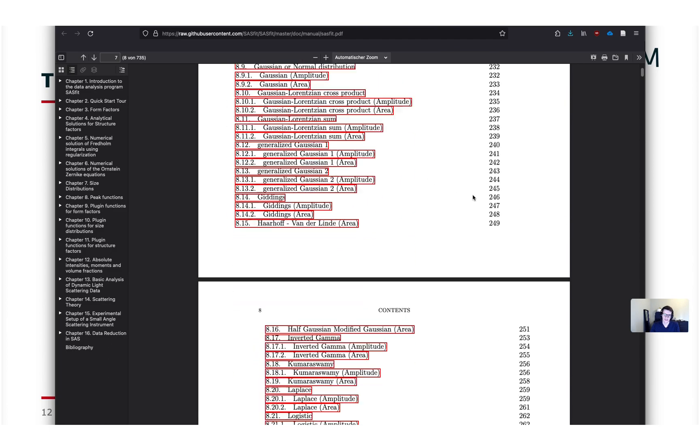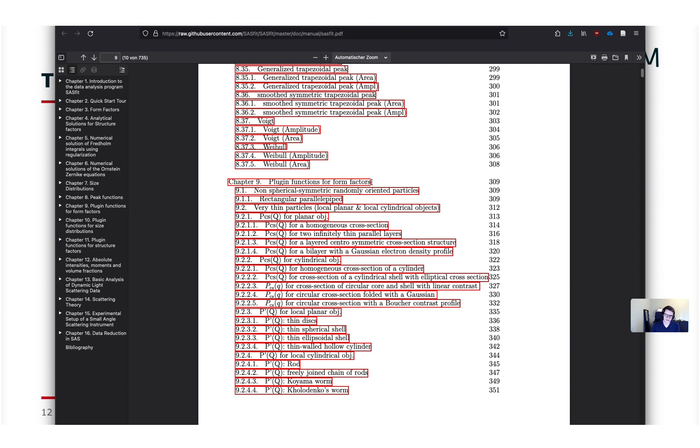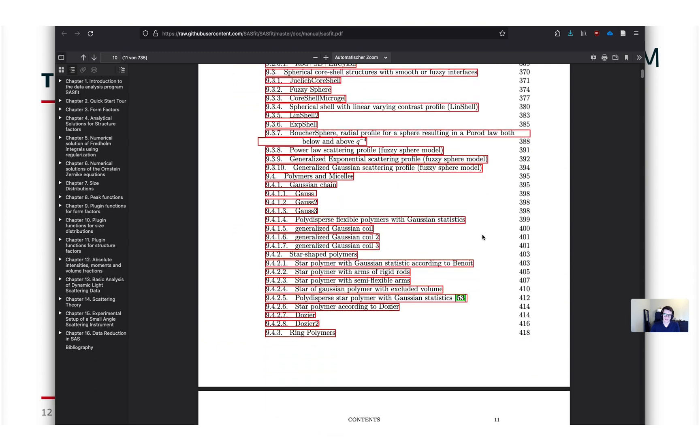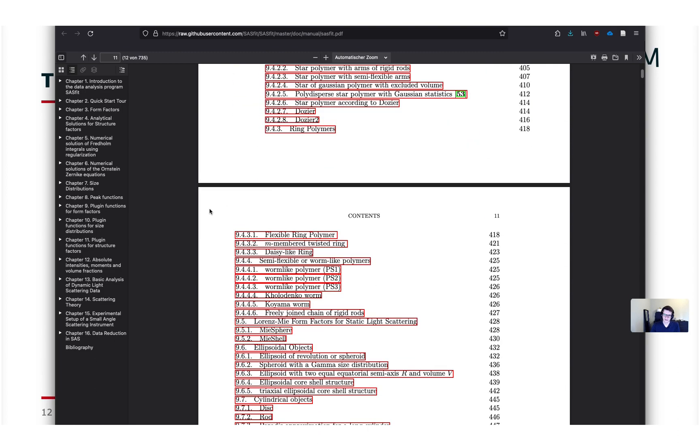Here we have size distributions and peak functions if you're looking for that. And also the definitions of form factors. Many of the functions were moved to plugin functions recently. So here's a separate section for that. In the form of plugin functions they can be reused easily in your own plugins for the program. If you want to implement your own models for example and reuse a specific already implemented model function. That would be possible.